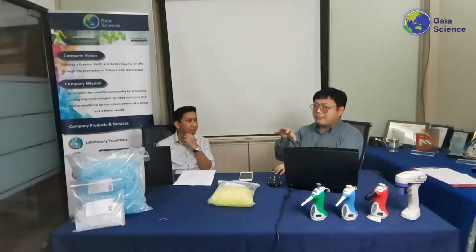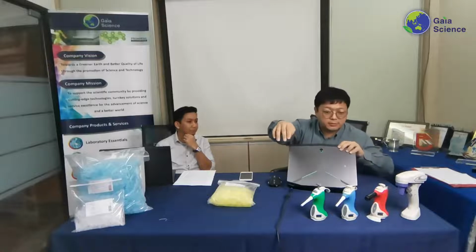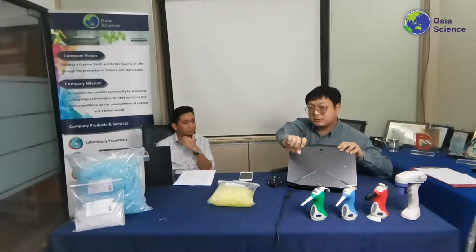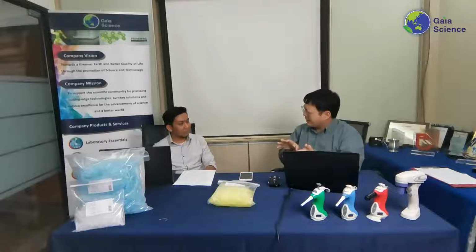Now again, that is more for pipettes that don't have a filter inside. I think if you see the lineup over here, we have the Vista Lab that has the filter in there. So that filter tip might not be too necessary for those models, but otherwise, like the normal ones, I think it is, correct me here, Mettler brand, right?